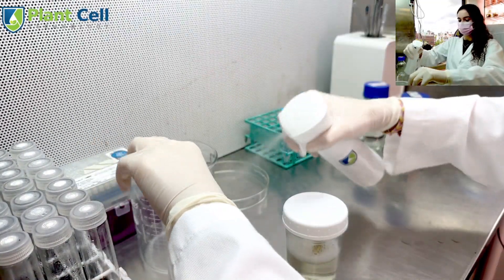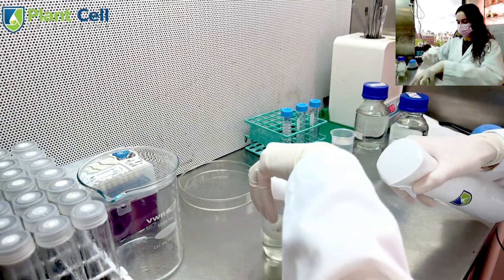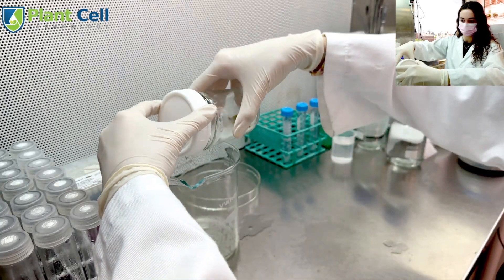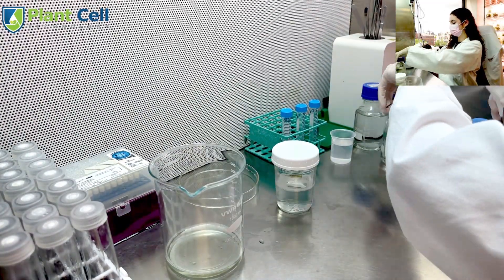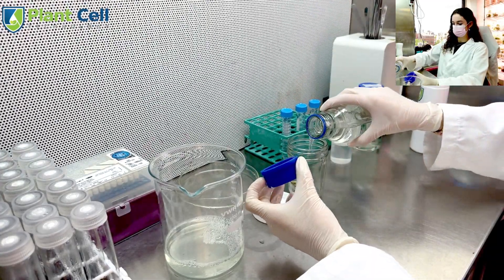Now that the time is up, I will re-sterilize my workspace and wipe down all surfaces. I will then open the jar with the seed pod and dump out the bleach solution, making sure not to pour out the pod. Next, I will add sterilized water to the jar and put it on our orbital shaker for 5 minutes, then pour out the solution and repeat these steps for 3 rinses total.